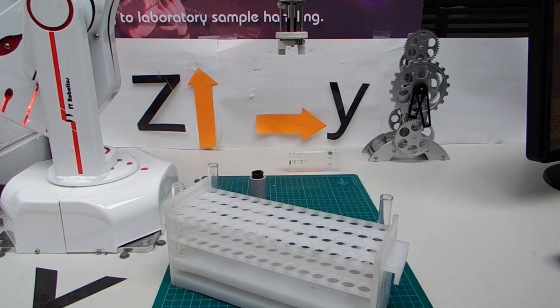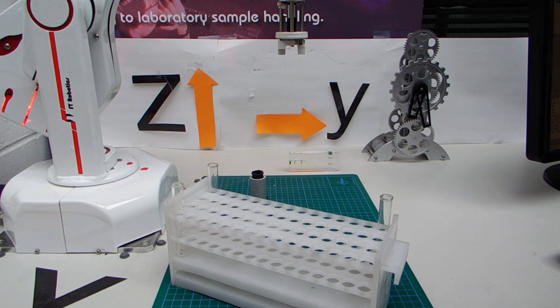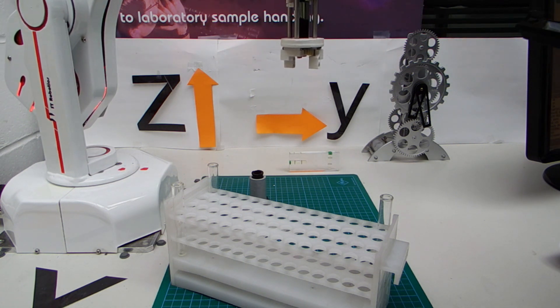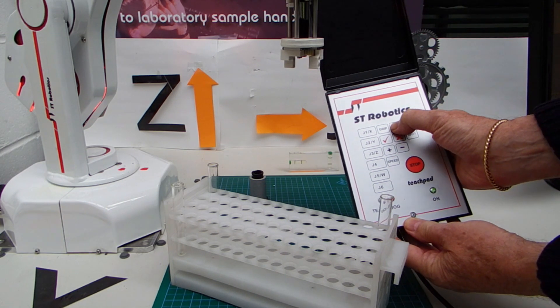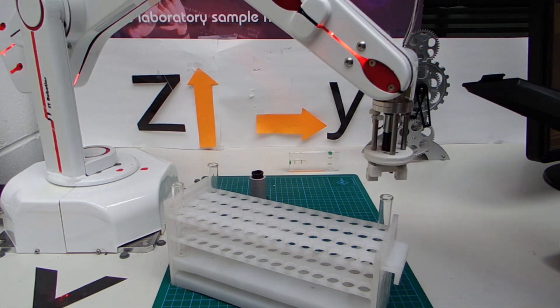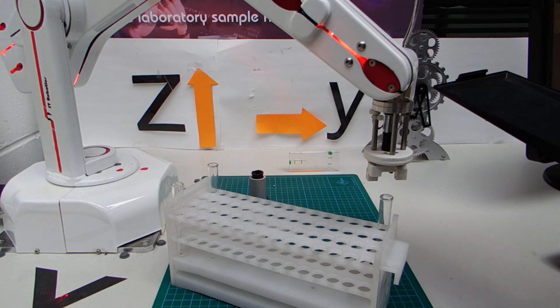The route list for the rack comes up and all the positions are 0. Then you start to move the robot to position 1, which is here. I'm using 25mm increments at the moment. Now I'm going to press the function button on the Teach Pad, which does align mode. Get closer and down. And now I'm going to rotate this because I want this gripper to be at the same angle as the rack.